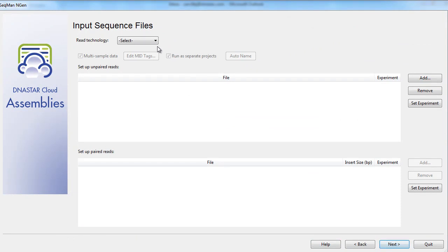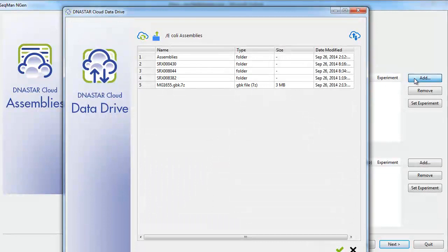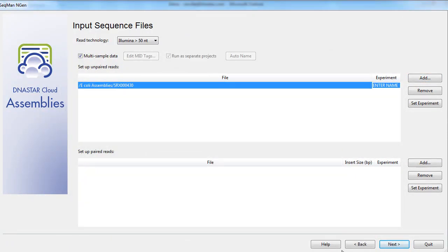Next, we'll select our read technology and start adding in our reads. We'll start adding in the folders we had previously uploaded from the data drive, and we'll name these folders as we go.